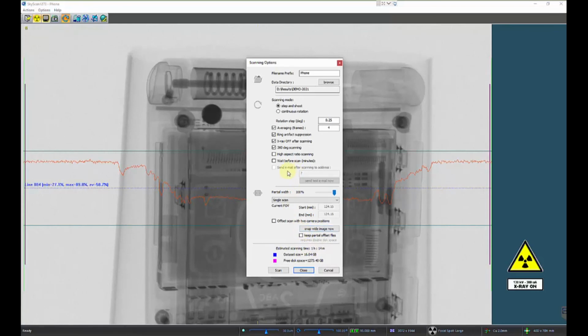Well, a 180-degree scan is a great way to acquire data for a fairly homogeneous sample, lower density, where we have good transmission through all views of the sample and no large disparities in density within the internal structure. For these types of samples, 180 degrees of coverage is perfectly sufficient to gain all we need in terms of structural information from the center of the sample.